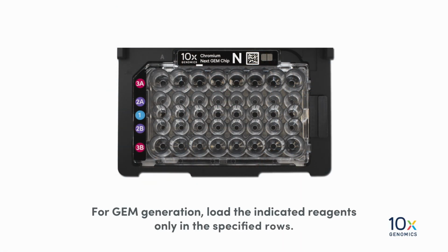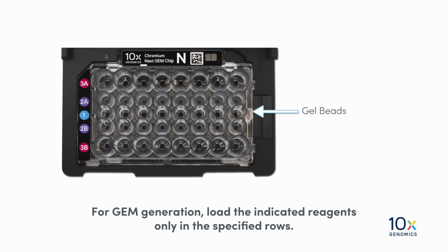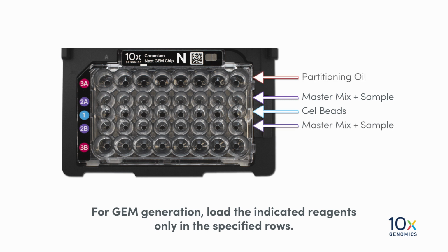For gem generation, load the indicated reagents only in the specified rows, starting from the row labeled 1, followed by rows labeled 2A and 2B, and rows labeled 3A and 3B. First, we will load the gel beads.